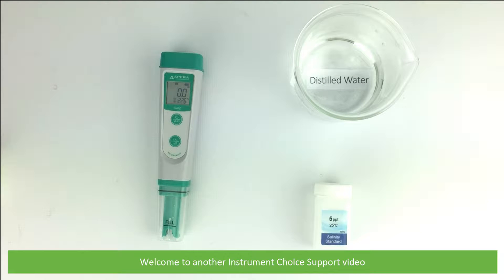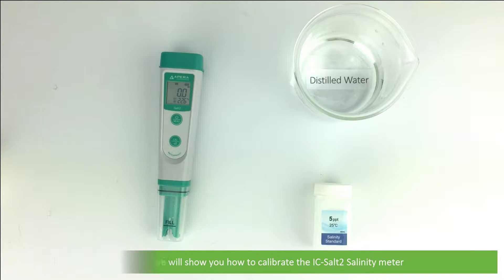Hi and welcome to another Instrument Choice support video. In this video we will show you how to calibrate the IC-SALT 2 salinity meter.